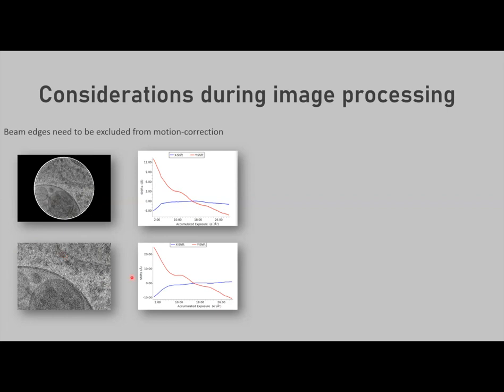You can see that if we determine shifts from that boxed-out area, there was actually a lot more sample motion than what was estimated when we did this on the whole image. So I made a special Unblur version that estimates sample movement on the central area, but then calculates back from the complete image.